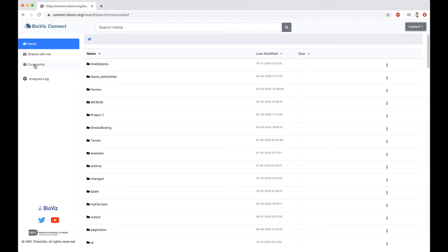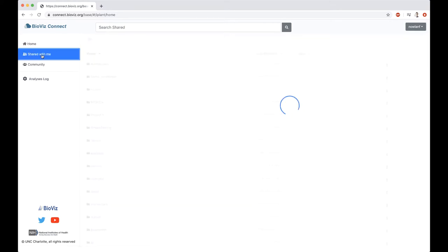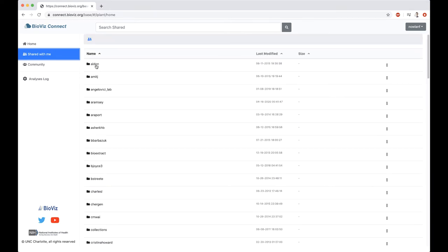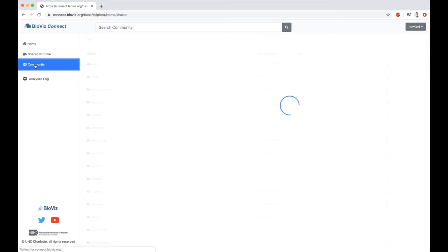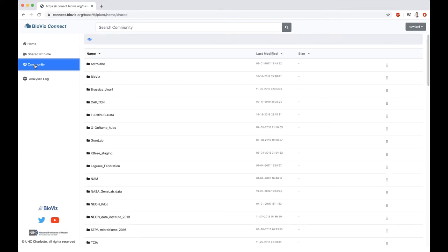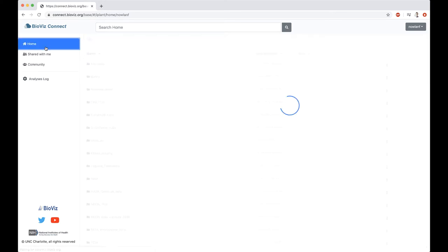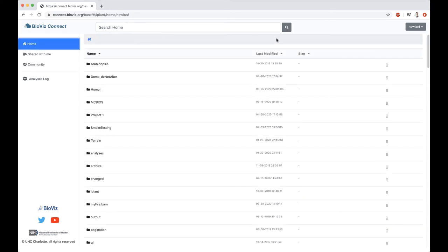These are quick links to some of the primary folders, so the user's home folder, shared with me, which contains files and folders that have been shared between users, and then community files and folders that are public for all Cyverse users. At the top here, we have a search bar, and you can search files and folders. It'll search based on your current location, so either home, shared, or community.